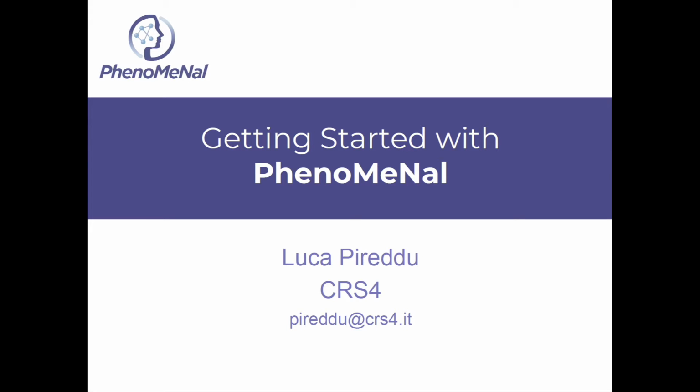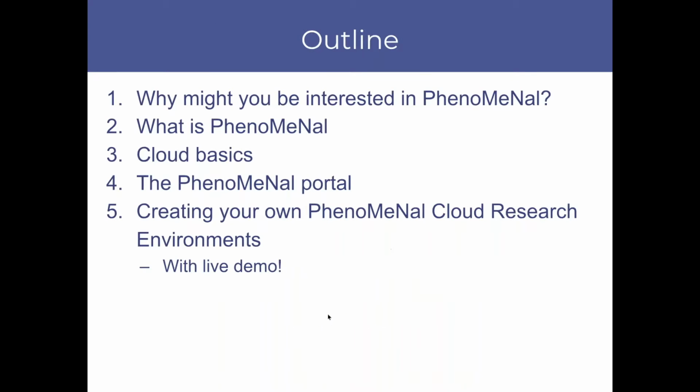Good afternoon, everyone, and thanks for joining this afternoon. So my talk today is entitled Getting Started with PhenoMeNal. I'll be starting the session talking about why you might be interested in PhenoMeNal. Then I'll explain what PhenoMeNal is and go through some basic cloud notions, which you might find useful if you decide to use PhenoMeNal. Then we'll go and talk about the PhenoMeNal portal, and I'll show you how to use it to create your own PhenoMeNal cloud research environment with a live demo.